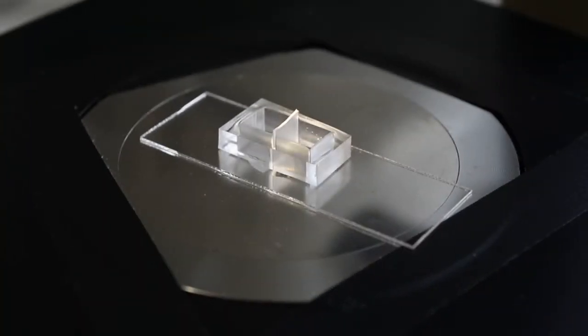The slight difference in our device is that what it enables you to do is it enables you to grow your soma in one compartment, so your cell body is sitting in one compartment, your axons then grow through and are sitting in a separate second compartment.